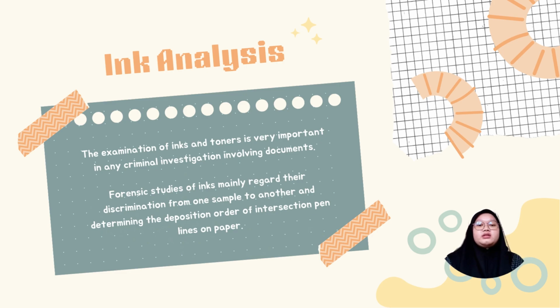Forensic studies of inks mainly regard the discrimination from one sample to another and determining the deposition order, or the writing sequence, of intersecting pen lines on paper.